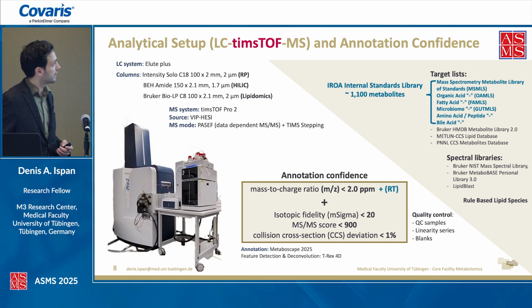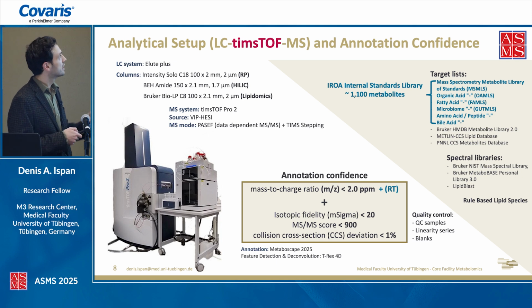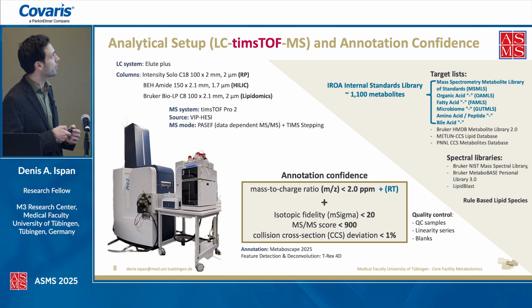Moving on to the analysis setup, we have dedicated columns for reverse phase for the nonpolar metabolites, for HILIC for the polar metabolites, and also a dedicated method for lipidomics. We use our timsTOF-MS with a VIP-HESI source for increased sensitivity. And the acquisition mode in the MS was PASEF, with TIMS stepping.